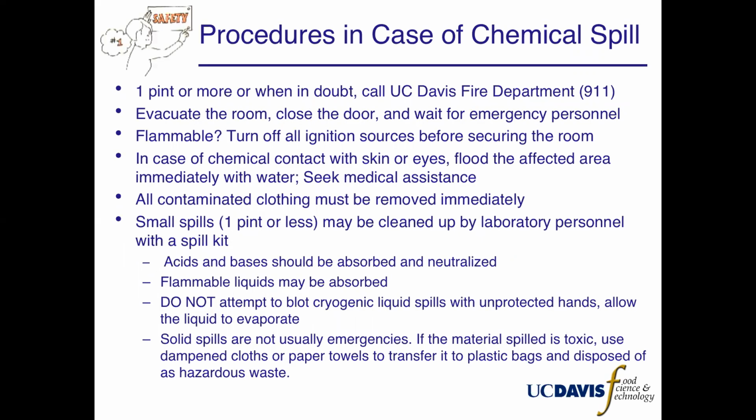In the event of a chemical spill, follow these procedures. If 1 pint or more is spilled, or if you are not comfortable cleaning up the spill, call the UC Davis Fire Department or 911 from a landline. Evacuate the room, close the door, and wait for emergency personnel. If the spill was a flammable substance, turn off all ignition sources before securing the room.